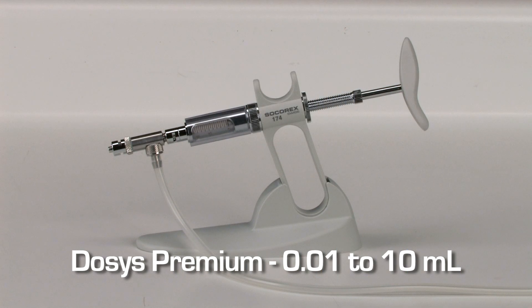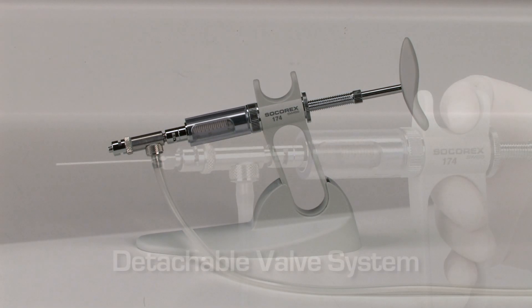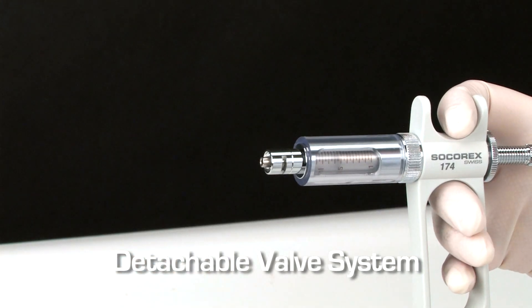The automatic, self-refilling Dosys Premium provides enhanced corrosion resistance. The plunger and valve are made of medical-grade stainless steel for extra durability. The valve system can be removed for added flexibility.